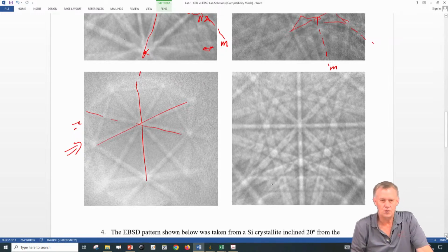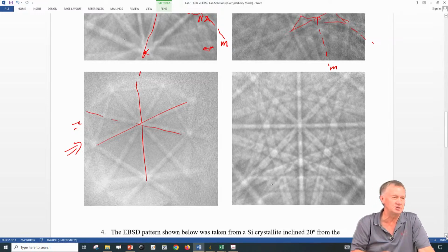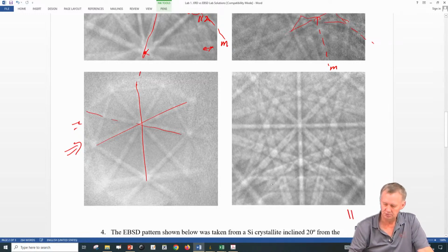But in 3 dimensions, we cannot see 5-fold symmetry. In 3-dimensional space, I mean, the diffraction's in 3 dimensions. Yeah, but it is projection. It's just the order occurs over a short range, not over a long range. Okay. So the ordering occurs over a short range, and you actually get this 5-fold symmetry. Okay. Okay, what about the one here? What do you got?